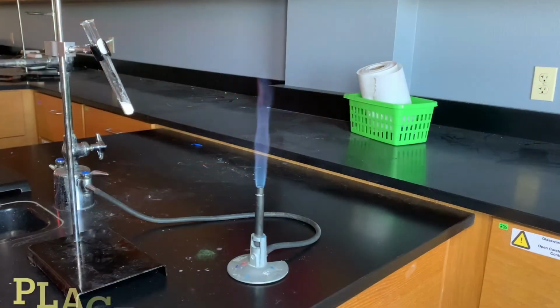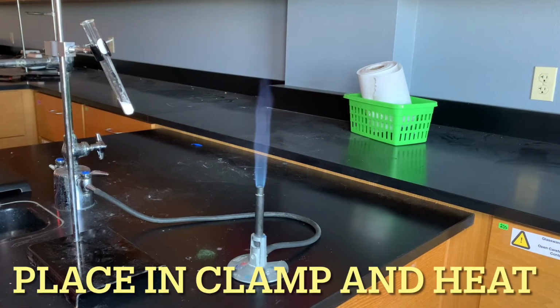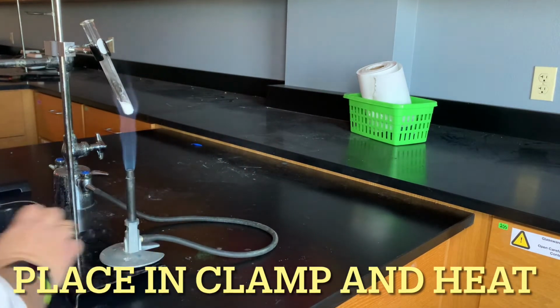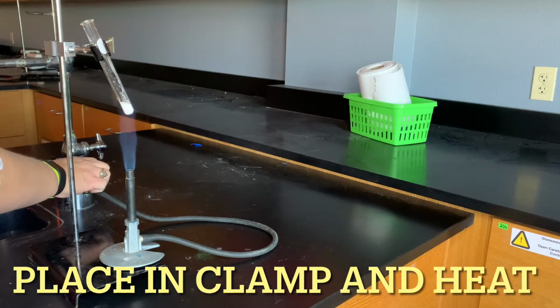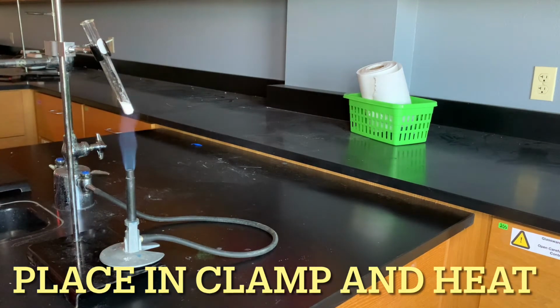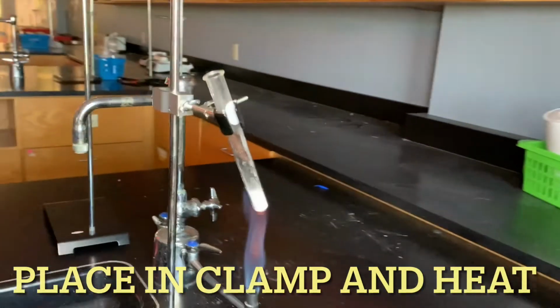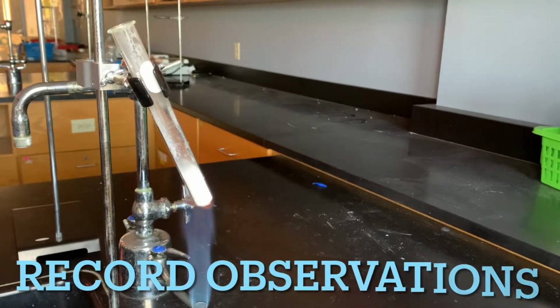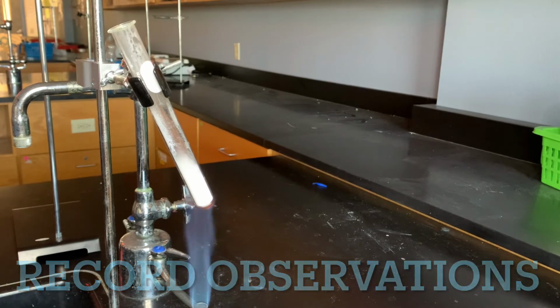All right, so we've placed our test tube onto the test tube clamp. We've adjusted the height of our Bunsen burner. We've lit it, and we're going to place it underneath our substance. I'm going to adjust it down just a little bit more. And we're going to wait. We're going to look for observations and record all our observations as we watch them.